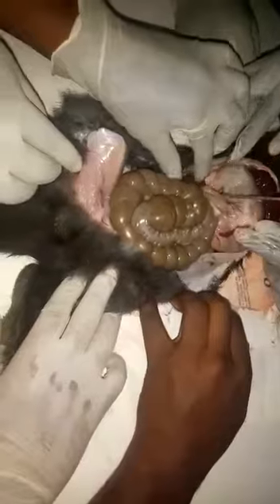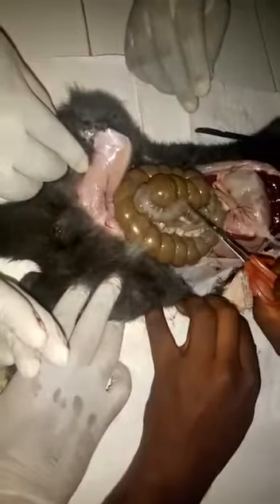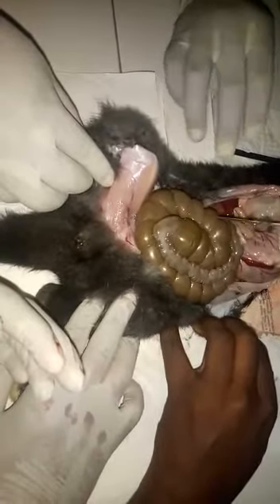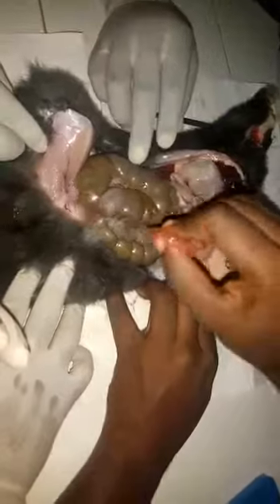And this is what? The small intestine. This is the small intestine. And this is what? Large intestine. This is the large intestine, isn't it? Yes. Good.